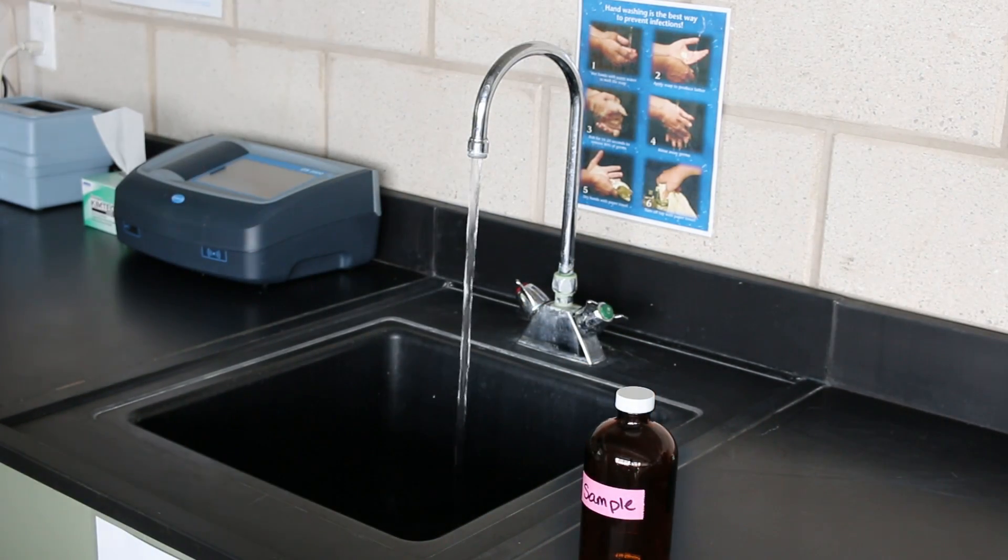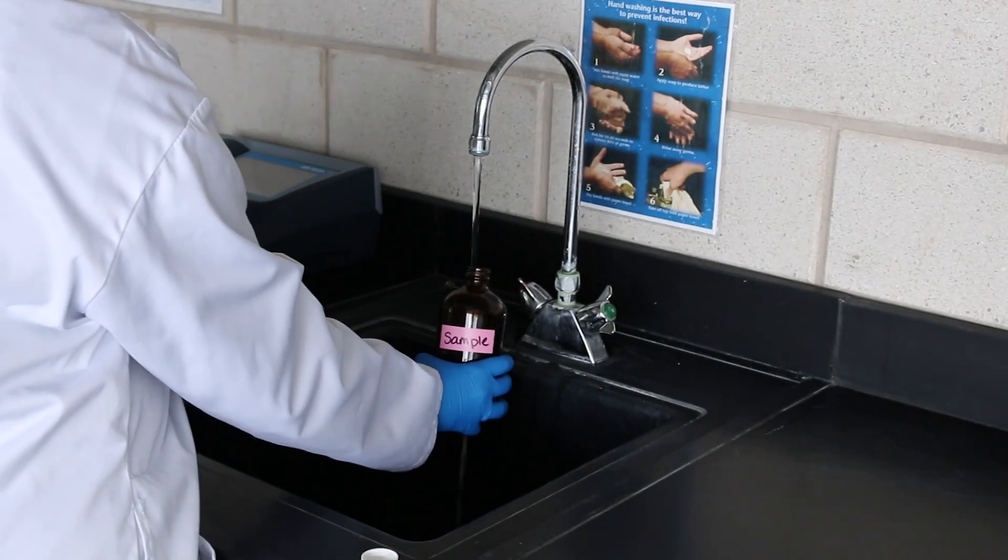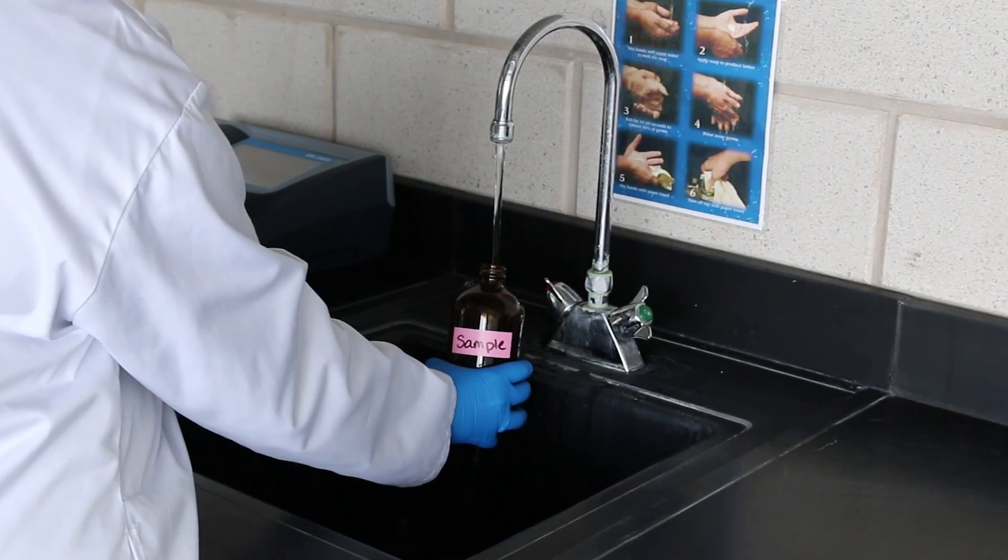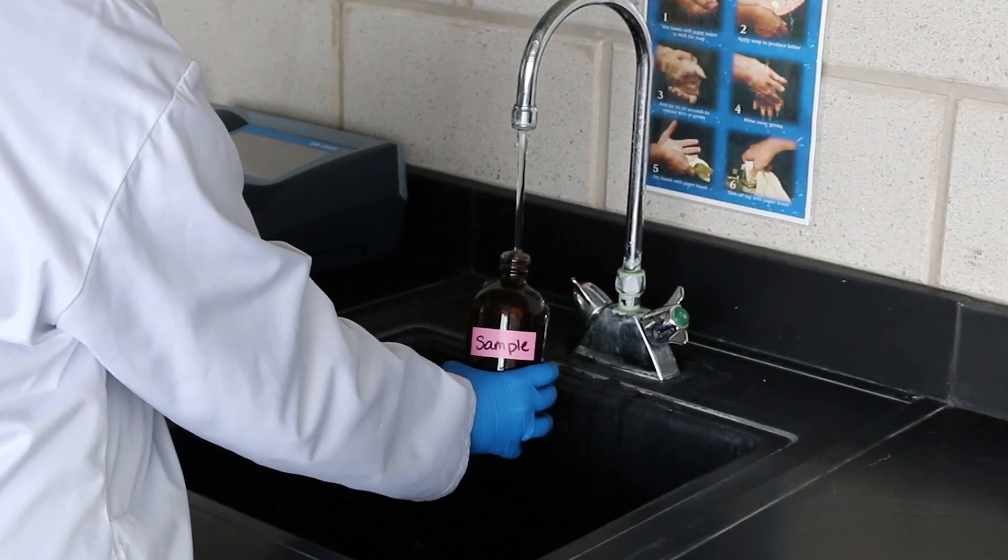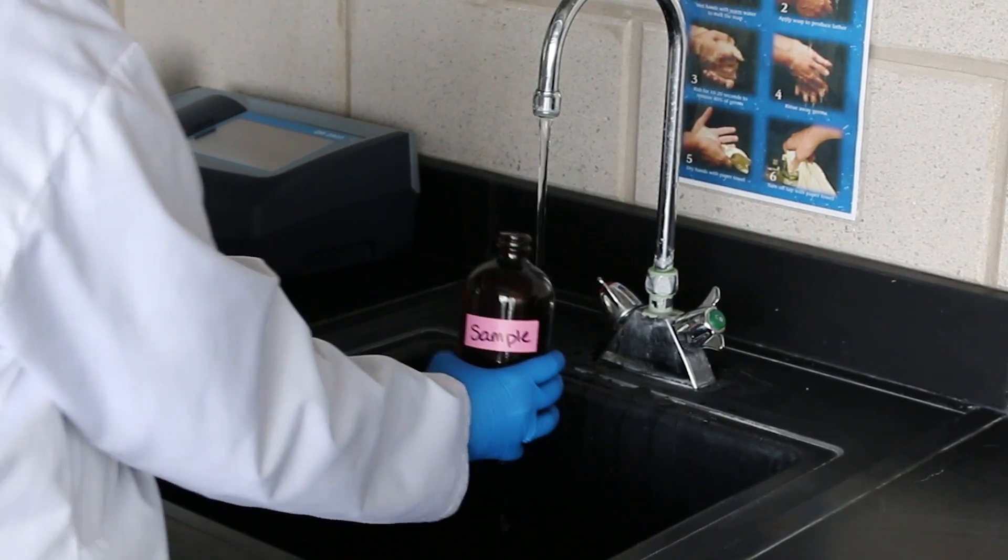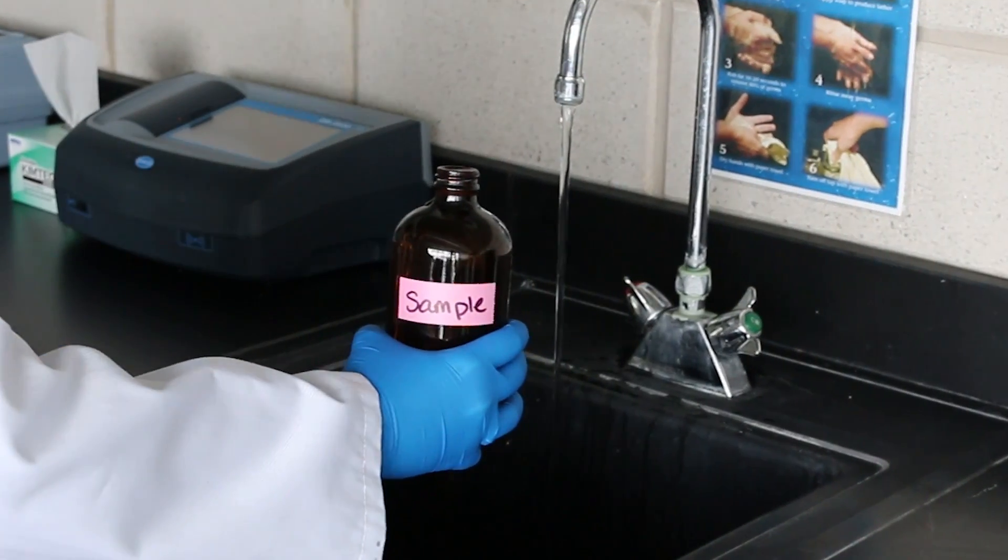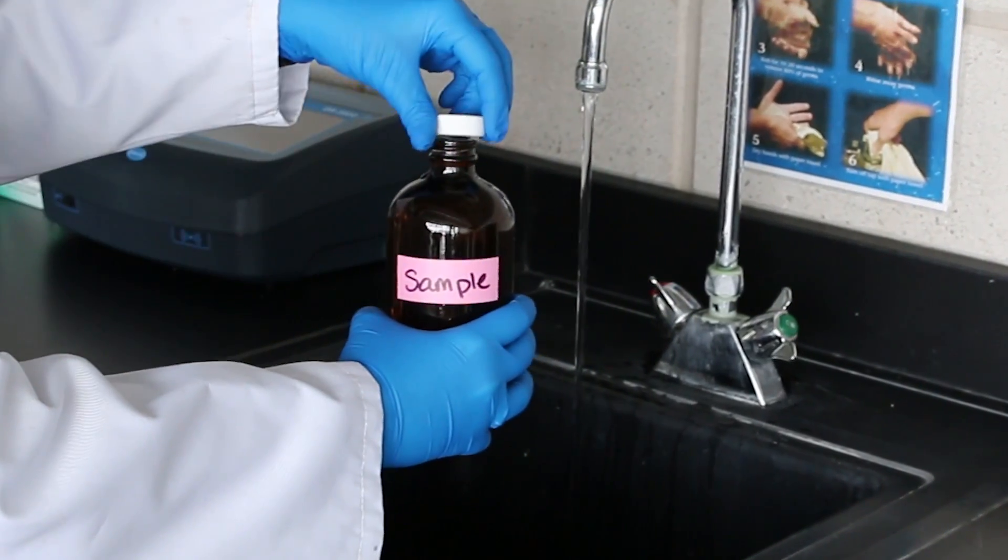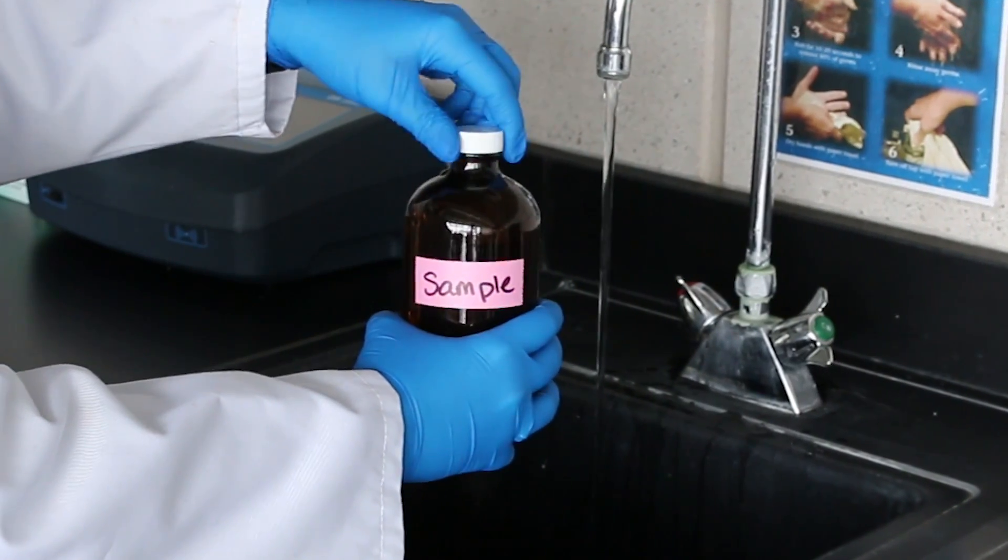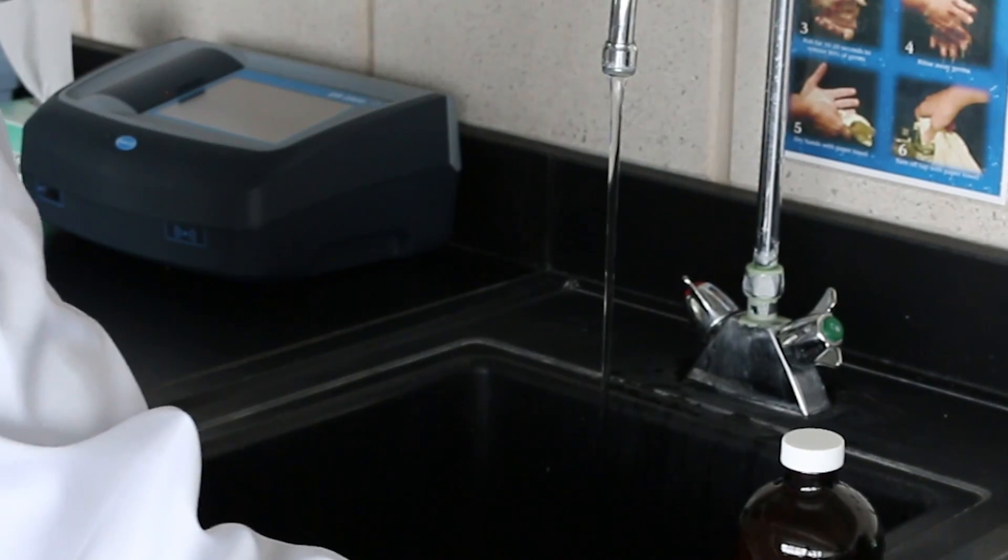Sample locations should be flushed to ensure the sample being collected is representative and no headspace should be left above the sample. The sample must be analyzed immediately after collection and cannot be preserved for later analysis as chlorine is a strong oxidizing agent and is unstable.